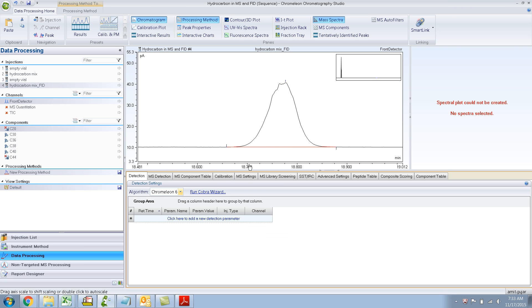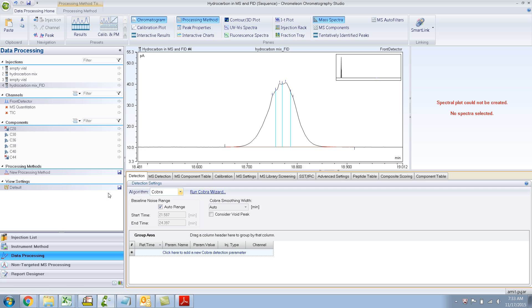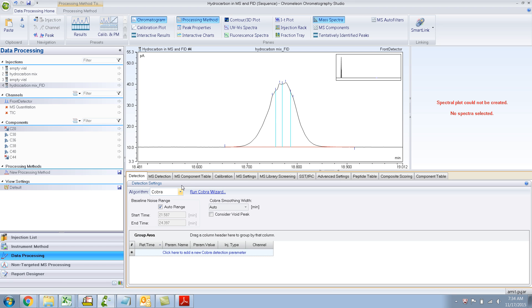Let's go with Chromeleon 6 because it seems to have detected the peak very well. In another video I'll show you how to make these peaks integrate properly using the Cobra algorithm, because there are many parameters we can change to make it look the way we want - even though there are some things it thinks are peaks that we know are not peaks.